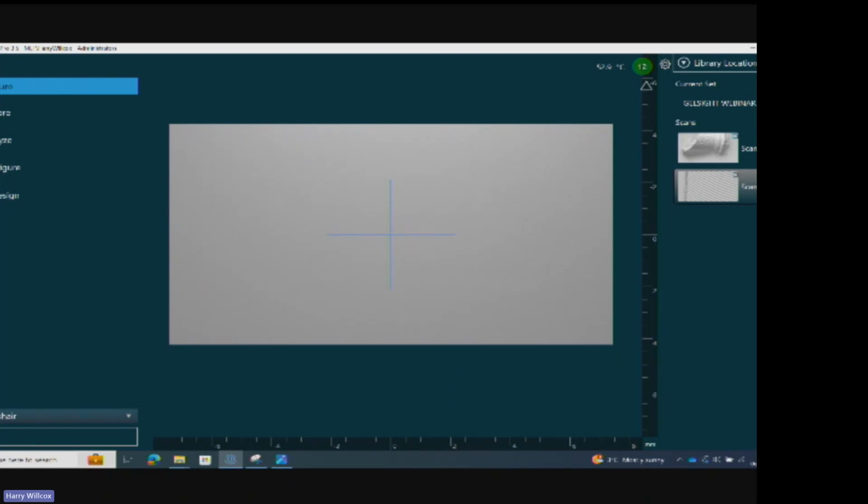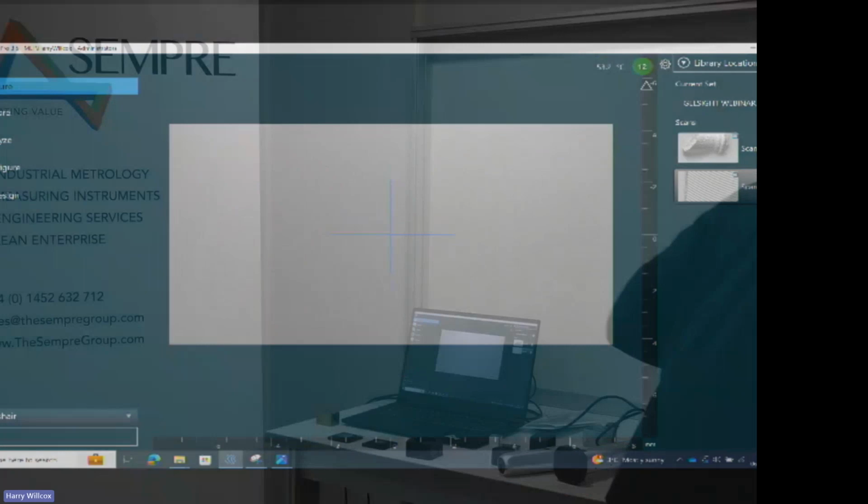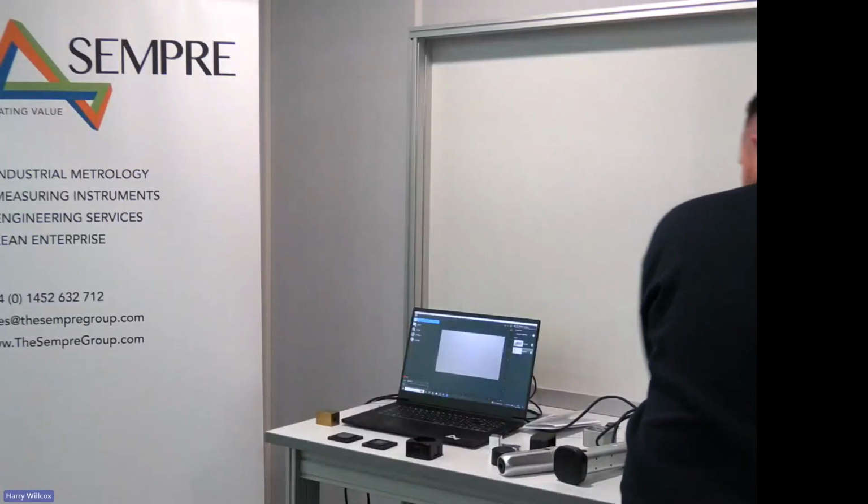Are the calibration artifacts supplied with the system, or do you need to carry this out? No. So when you buy a system, again, I'm going to go to my box on the right-hand side here. The idea behind the Gelsight system is that we're fully portable.